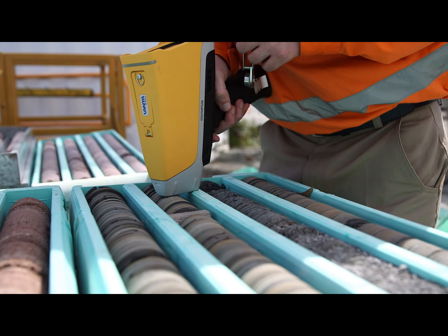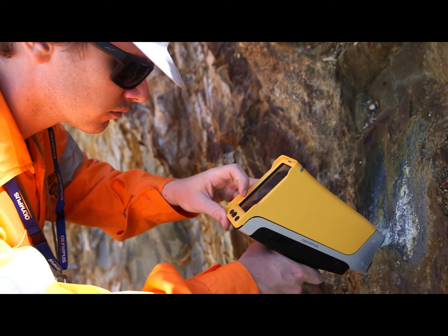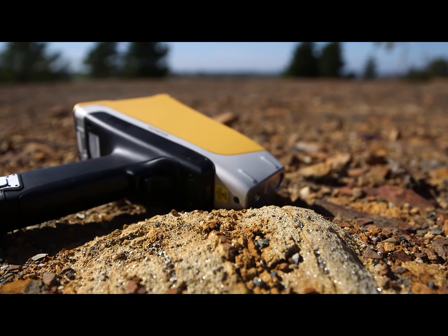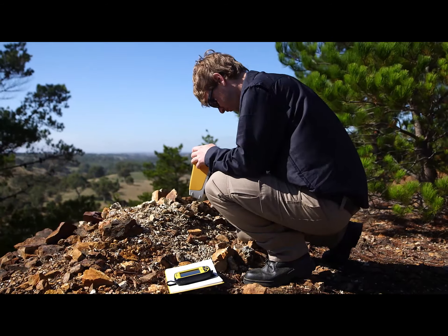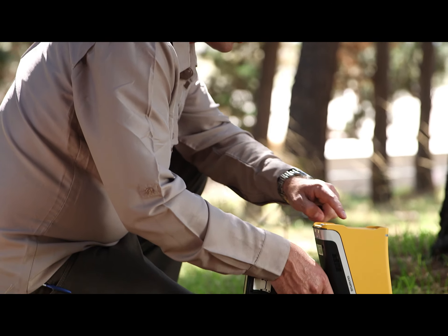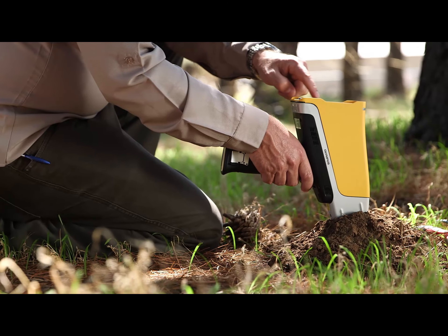Let's start with no sample preparation. We have hundreds of customers testing directly on drill core, directly on rock faces, directly on soils, directly on unprepared blast hole samples — and all of those samples are heterogeneous. A lot of our customers take multiple measurements and take the average of those readings to overcome that, getting qualitative to semi-quantitative data, but it's fit for purpose. We've also got customers testing gold in activated carbon directly on the carbon, and doing copper in liquids in SXEW plants — no sample preparation. There's a wide range of applications for customers doing no sample prep.